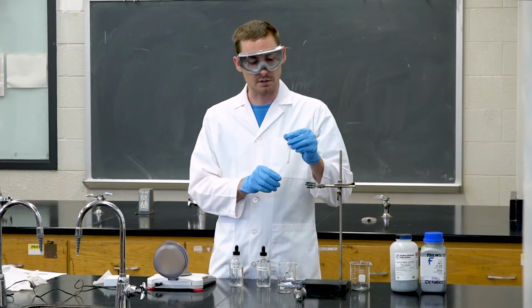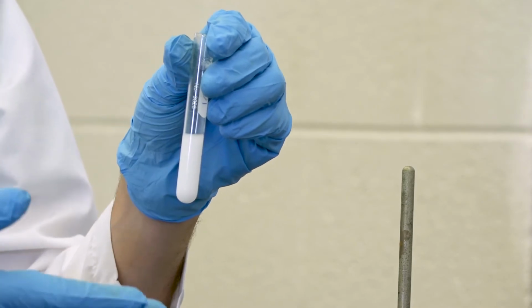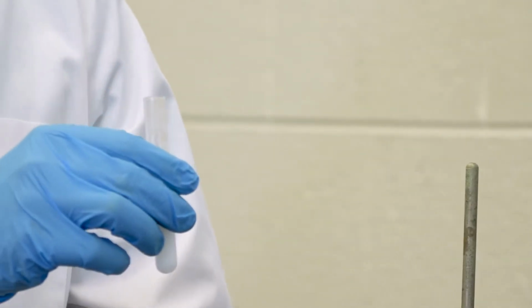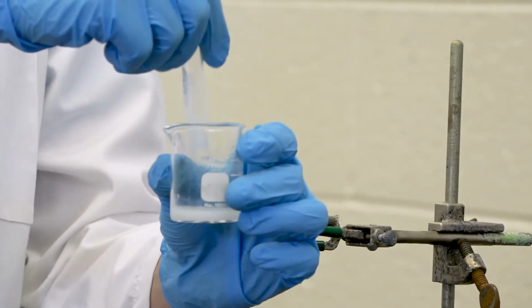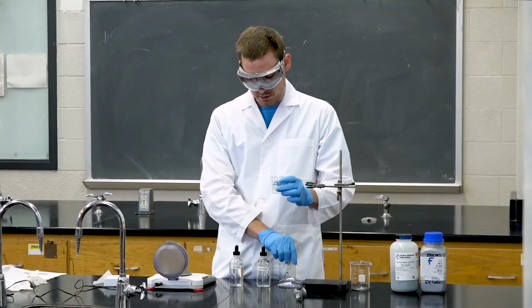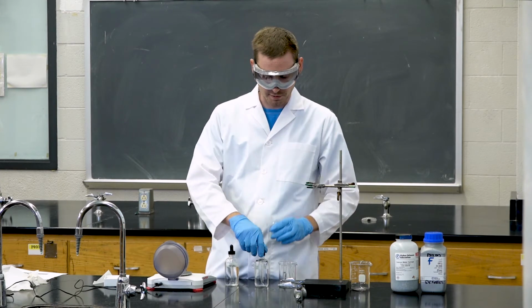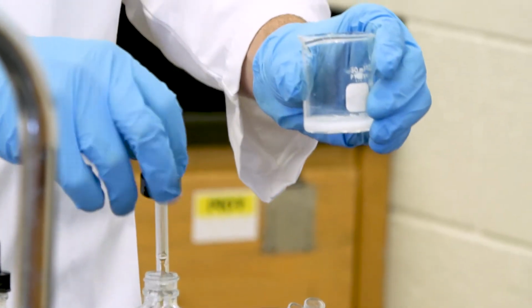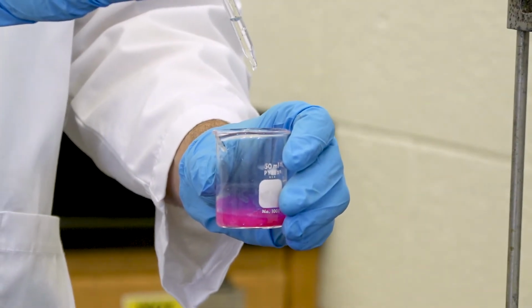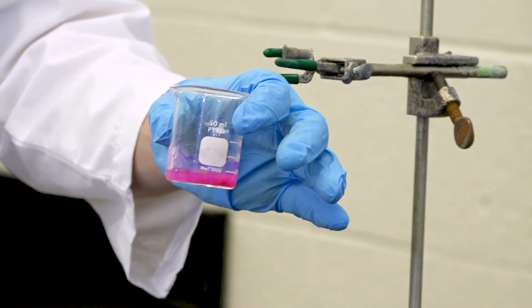After the solution has stopped forming bubbles and the calcium metal has been consumed, you'll be left with this white precipitate, and we can then add it to a small beaker, like so. Once we have the solution in the small beaker, we can add 2 drops of phenolphthalein indicator, which will produce this bright pink color.